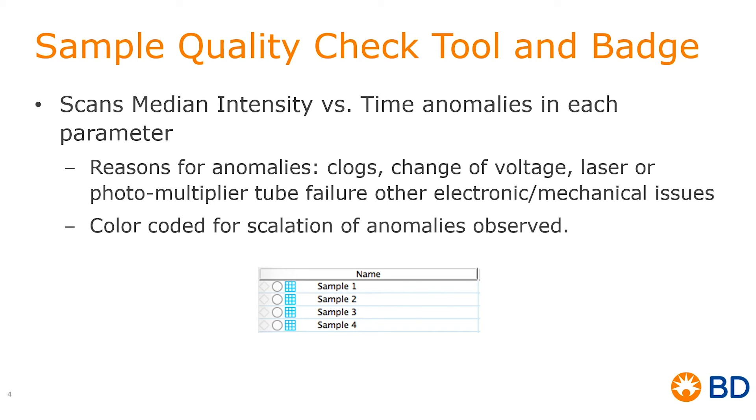Should you get a purple or red, we recommend that you then use an exclusion or not gate to remove the anomalous data from your analysis. And like I mentioned previously, I will go through how to do all that with you in a couple minutes.